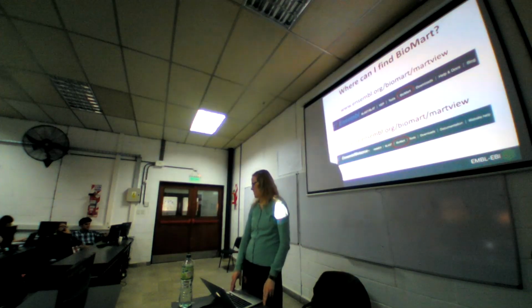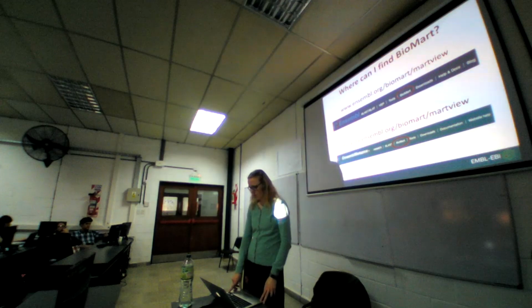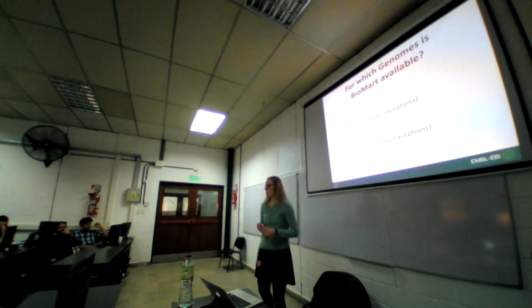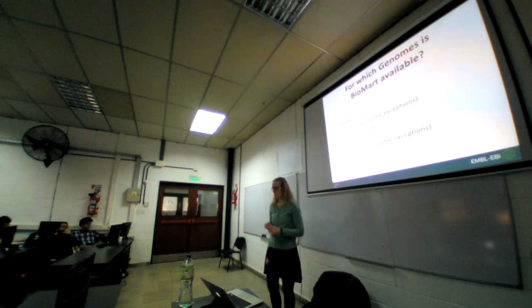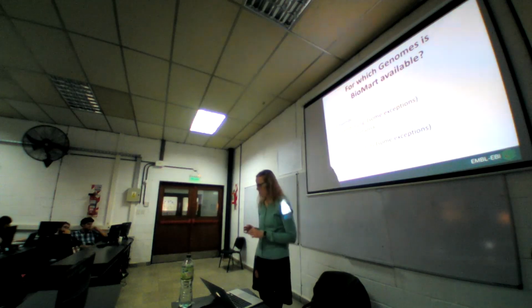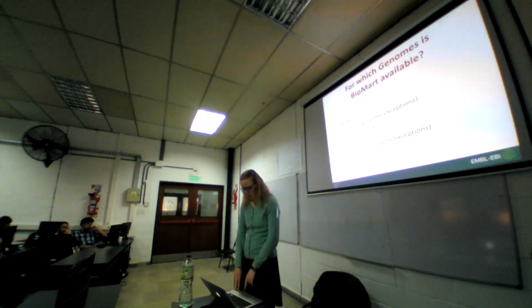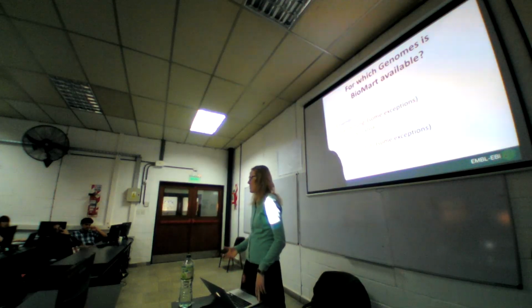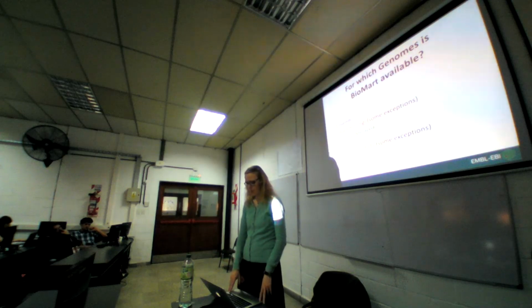You can find this tool in the top header of your browser, in Ensembl and in Ensembl Genomes, and also in the Tools section. It is available for all species in Ensembl and many species in Ensembl Genomes, except for bacteria. I'm sorry about that. This is because we have 44,000 strains in Ensembl Genomes for bacteria.